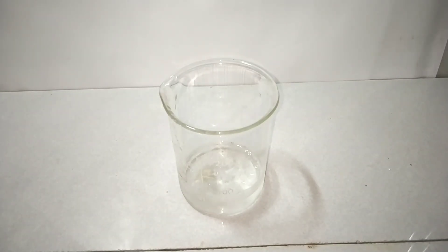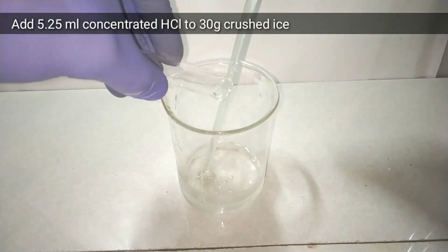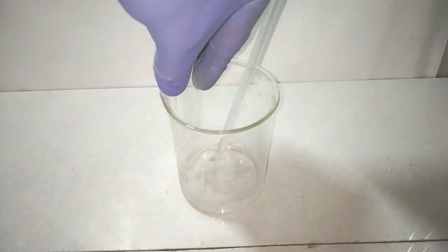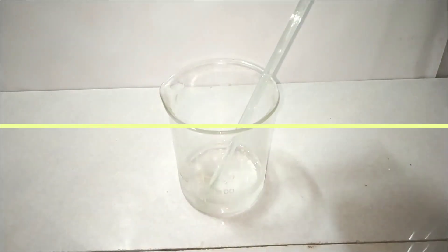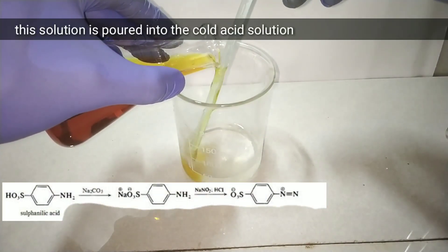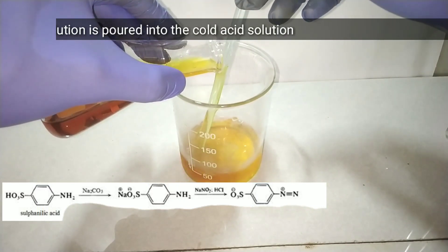Now we are making another solution by adding 5.25 ml of concentrated hydrochloric acid into 30 grams of crushed ice. After cooling, we add that previously made solution into the cold acid solution.